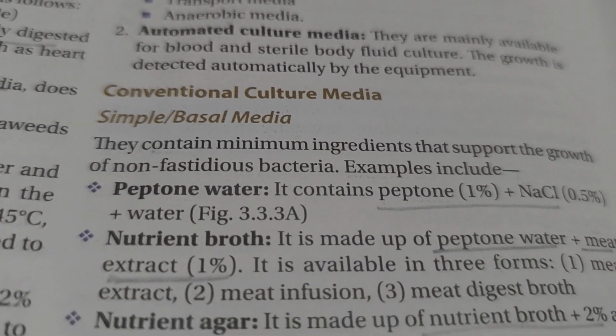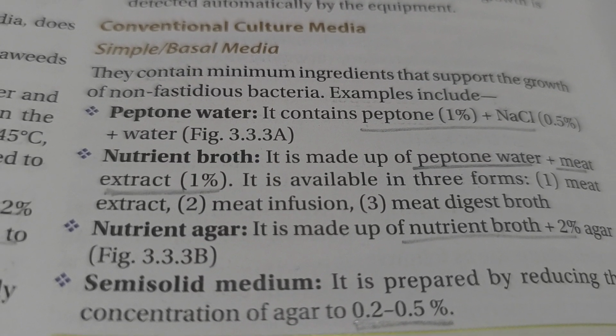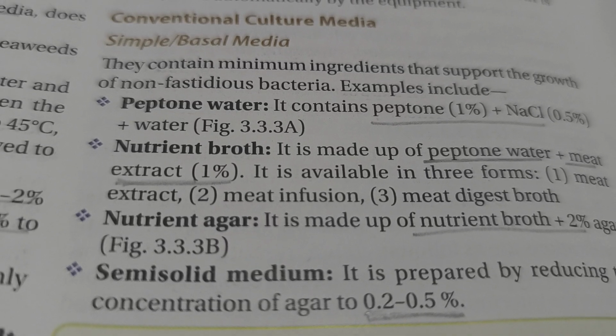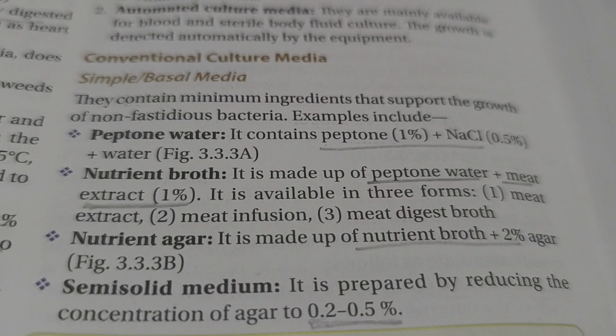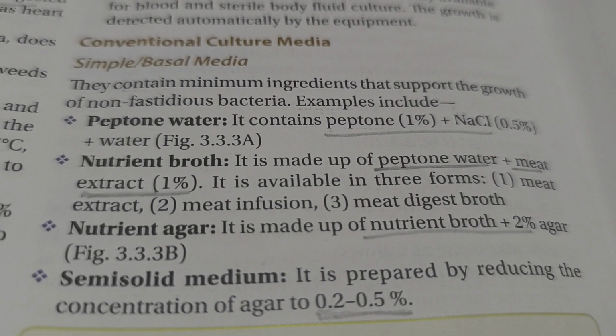Conventional culture media. Simple or basal media. They contain minimum ingredients that support the growth of non-fastidious bacteria. An example is peptone water, which contains 1% peptone and 0.5% NaCl plus water.